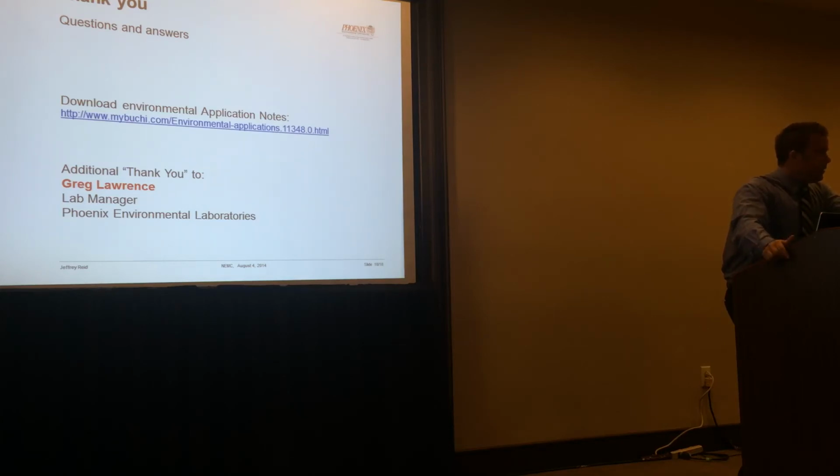There's many other methods out there, and you know, the more you get to it, like when you're testing for PCBs, you're testing for more volatile compounds. We are finding out that using a certain parameter setting you're able to achieve the same as any technology out there, but the company we're working with and ourselves aren't really willing to go forward with it yet. We're still waiting. But this here, 8270, which is your most common one out there, just pretty much the evaporation of DCM. If you come see the poster presentation, you can see they're all comparable to any technology out there, or sometimes even higher in some better cases.